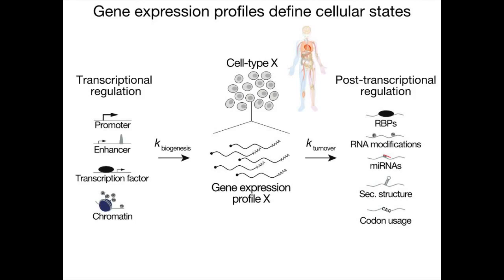Now, because of the importance of understanding the molecular basis for gene regulation, several approaches have been developed to globally address the kinetics of gene expression at the genomic scale. For example, genome-wide analysis of nascent RNAs engaged with transcriptionally active RNA polymerase by high-throughput sequencing, such as through approaches like GRO-seq, PRO-seq, or NET-seq, represent powerful methods to investigate transcriptional activity.